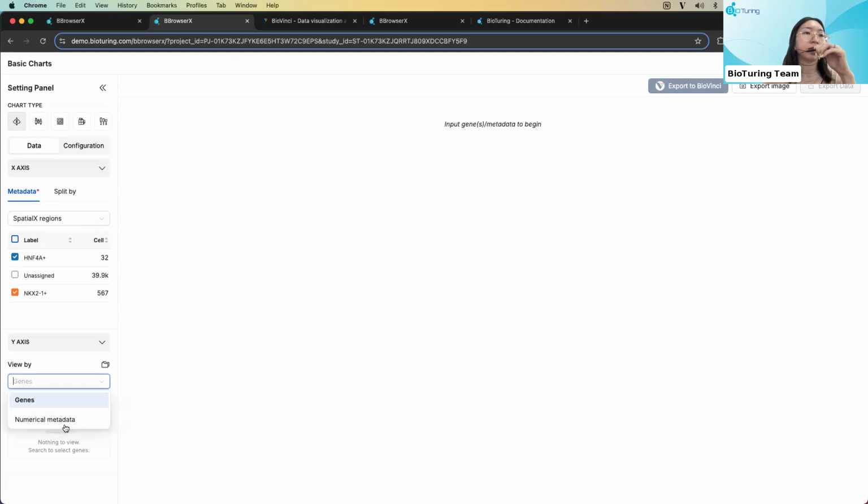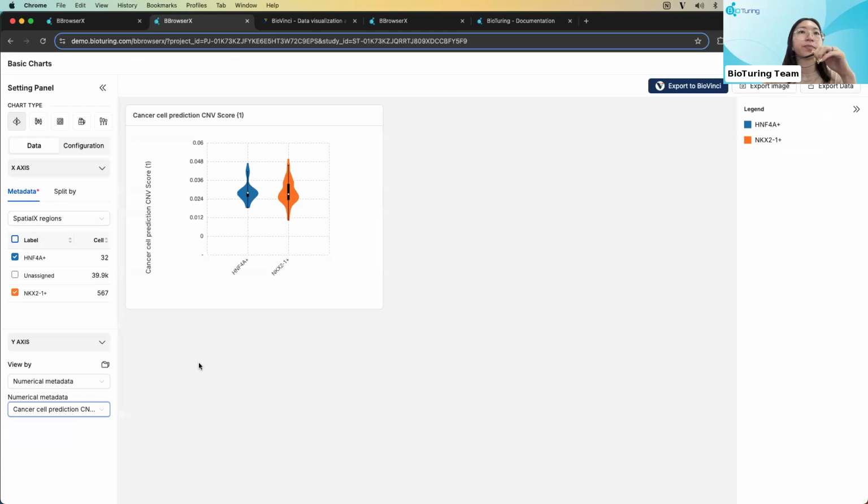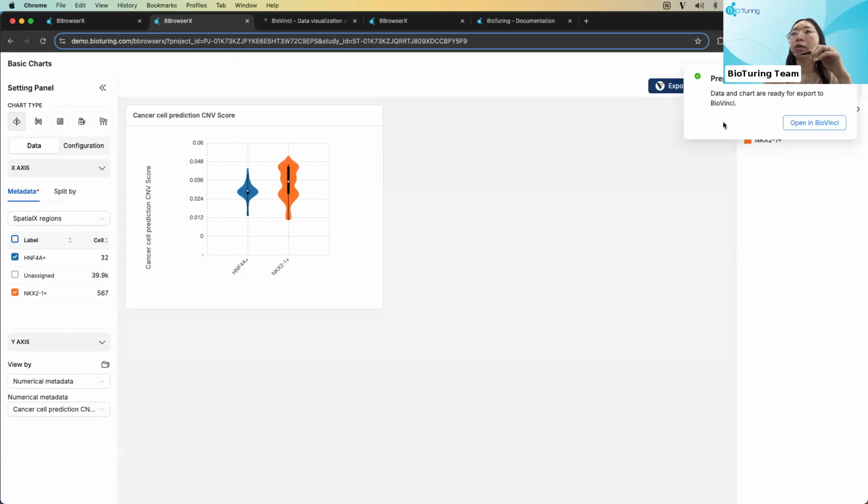Click this, and then I want to see the distribution of the CNV scores. This one, I believe. Okay, we actually have an export to BioVinci button located here. And once that's ready to open, you can click open in BioVinci, and this will open a new tab.